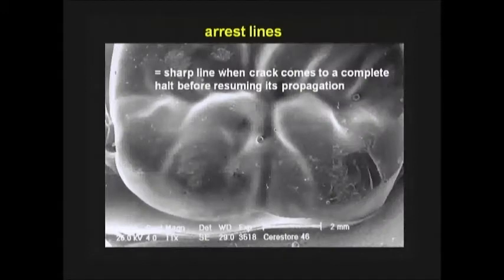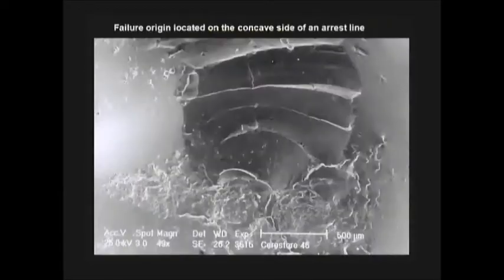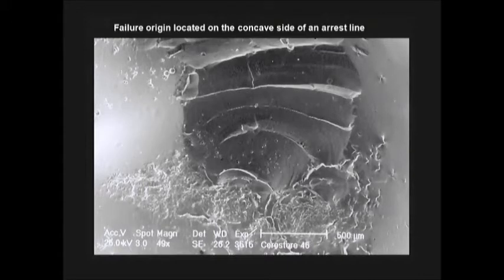An arrest line is a sharp line where a crack comes to a complete halt before resuming its propagation. Typically here, a tiny little chip on an occlusal surface of a very old Cerestor crown. So you see one arrest line, a second, a third, a fourth. It started here. This is wear, contact wear. The failure origin is always located on the concave side of an arrest line. So this is concave here, so the origin is somewhere here.